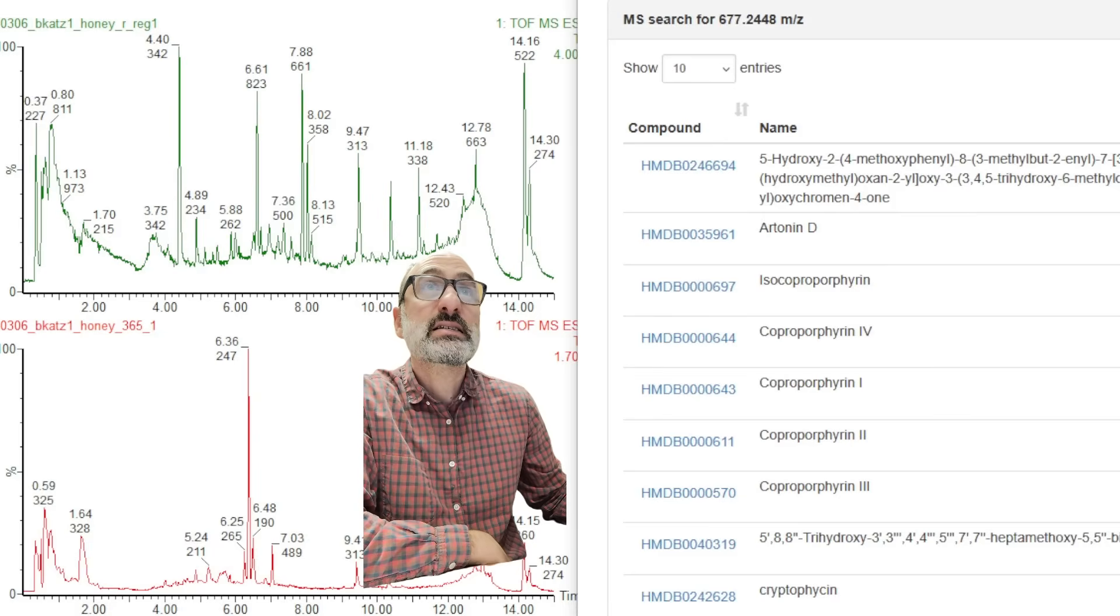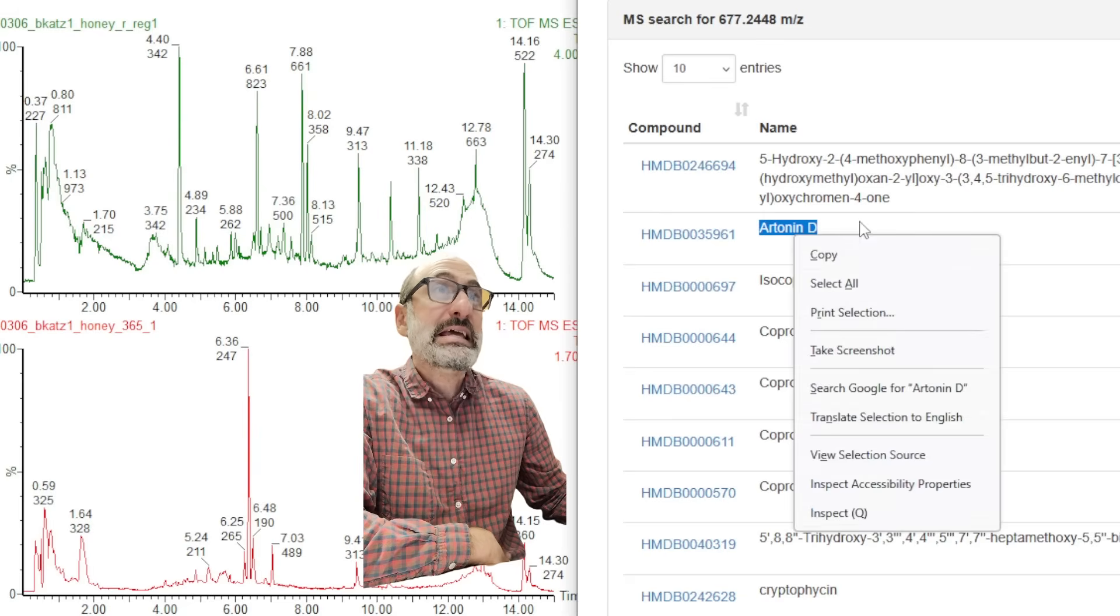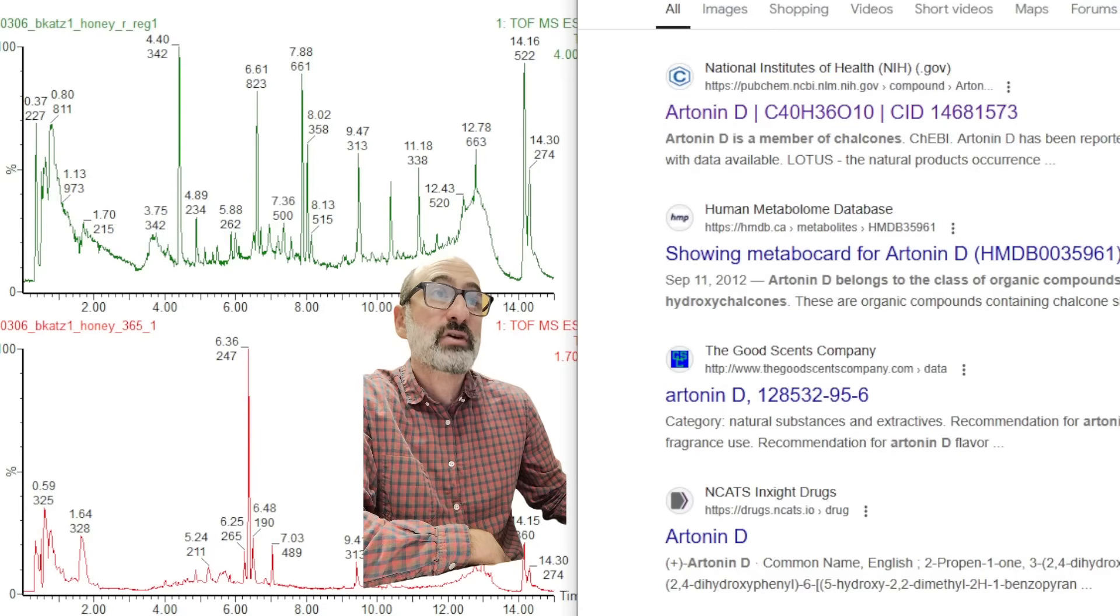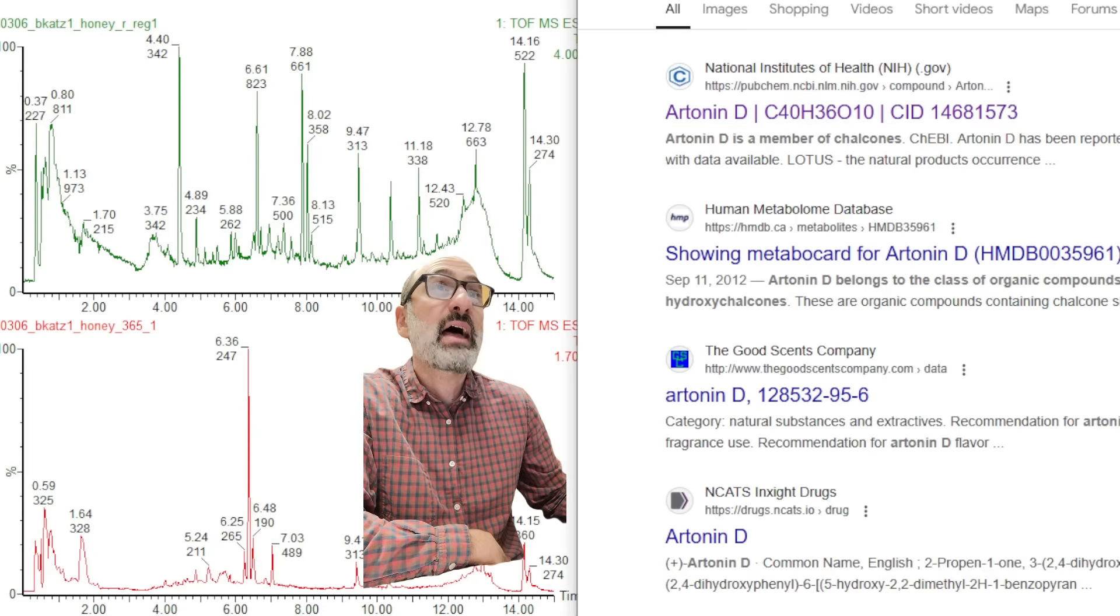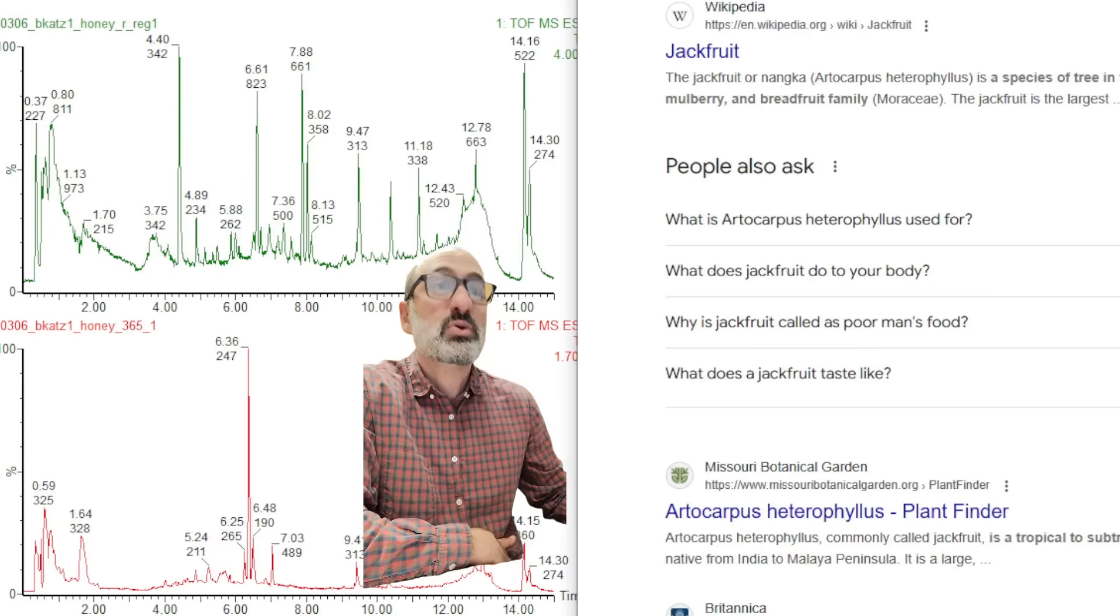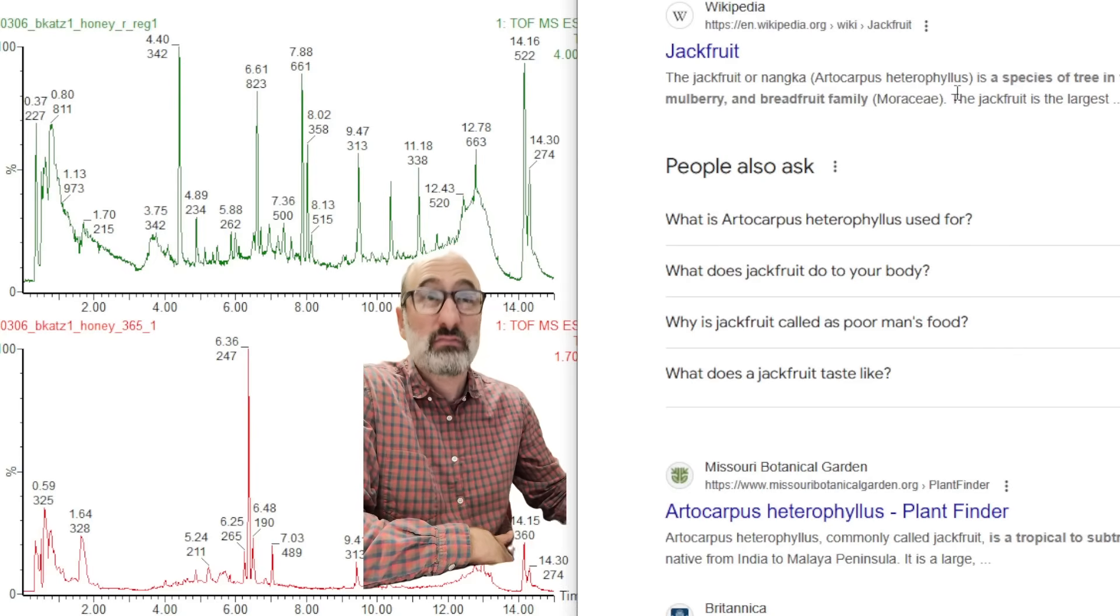All right, so next peak, 677. The only thing I'm seeing that makes sense with this is R-tonin-D, which is natural substances and extractives. Looks like it's coming from this plant here. That is jackfruit. So, I guess some sort of jackfruit extract. I don't know if that even makes sense.